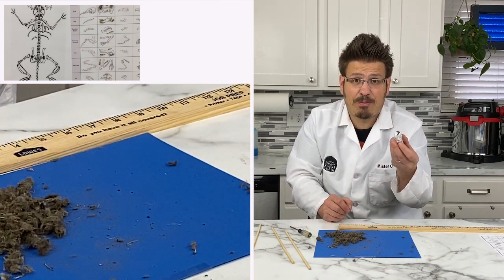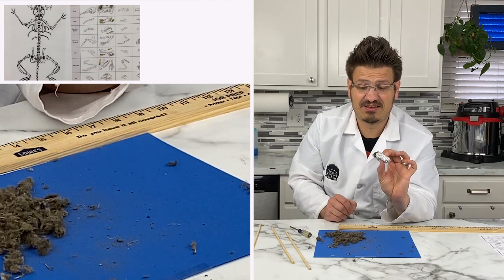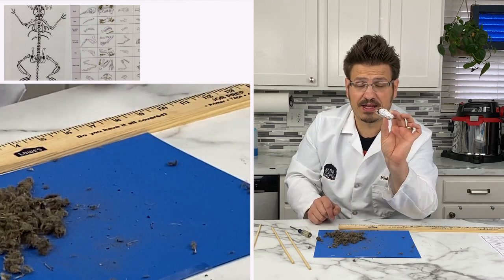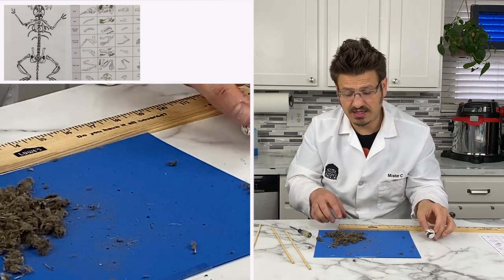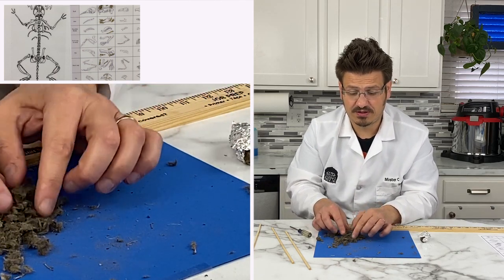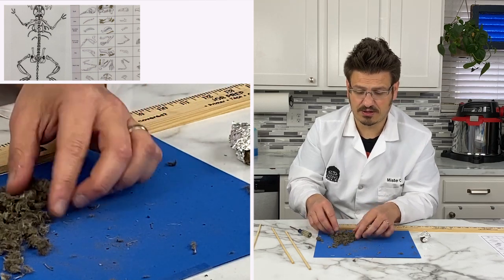And it spits this owl pellet. That's why they call it an owl pellet. So this is regurgitated leftover mouse parts. Or it depends on what was inside of this. That's what the owl ate. So this is actually fur, the outside part of the mouse, the fur, the soft part. Okay? That was a great question.